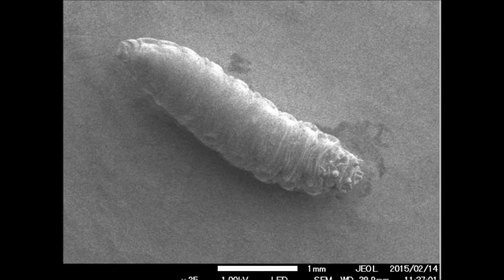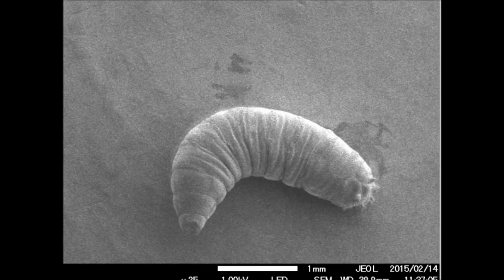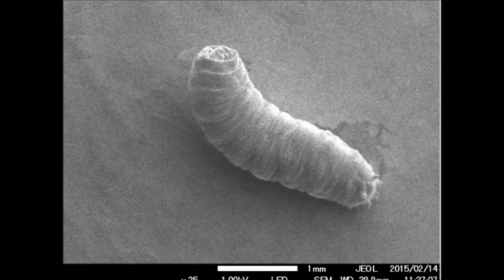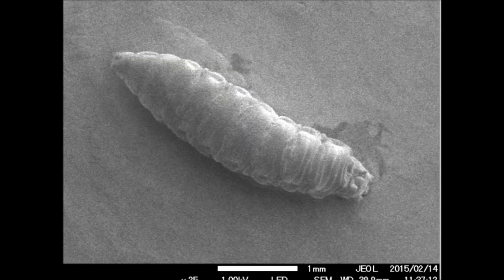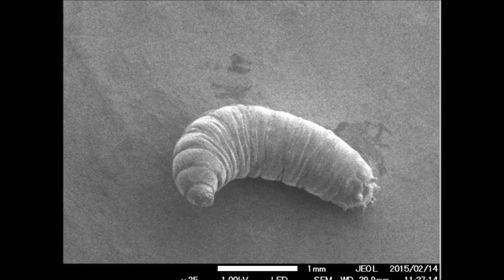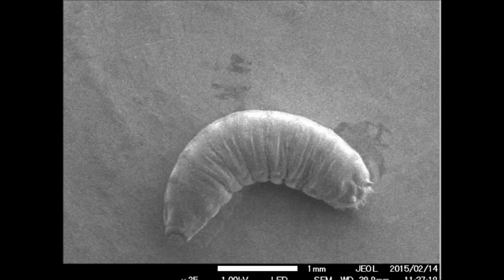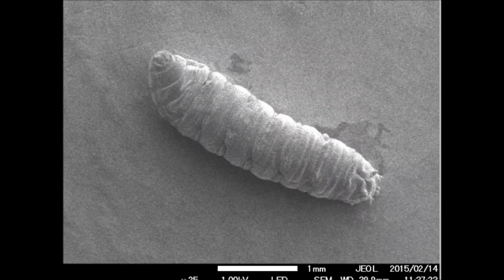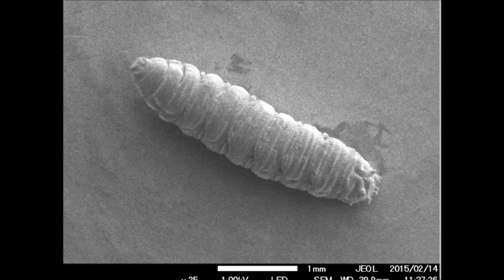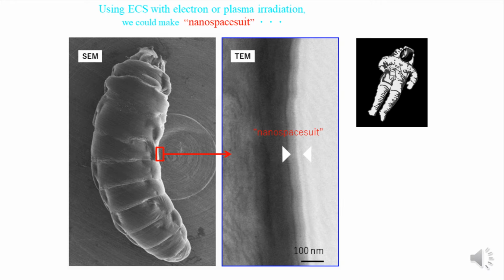When we put the larvae of Drosophila into the vacuumed chamber in the electron microscope, we found they were moving. Why? As I showed you the crushed larvae in the former slide, but this one is moving. Why can they live in a harsh environment like space? How can their lives be protected in harsh circumstances?